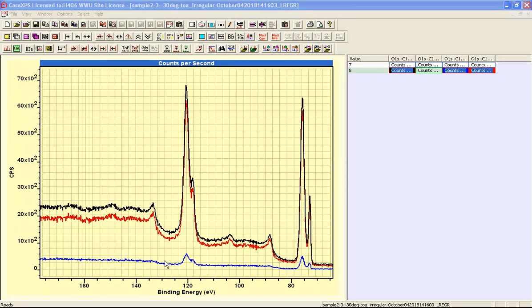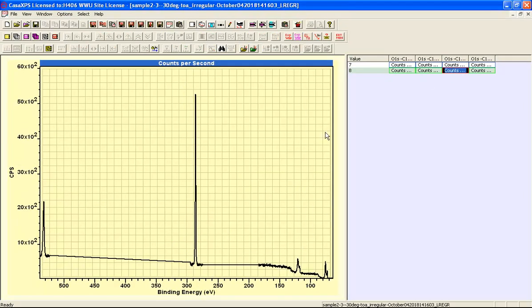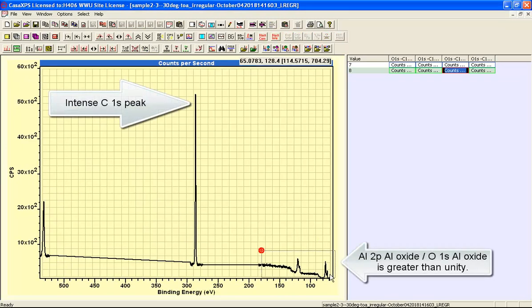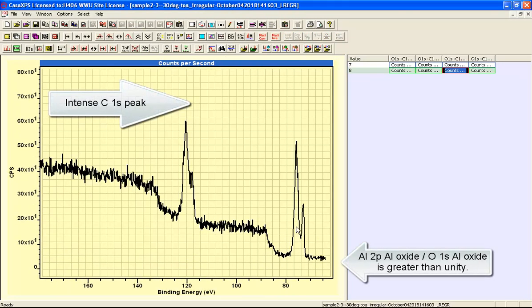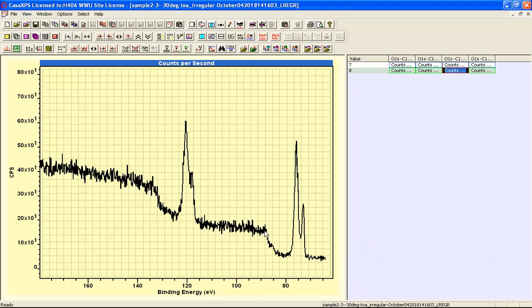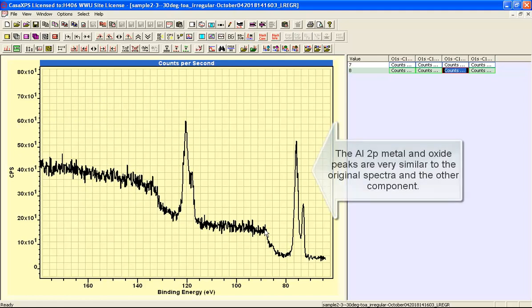The second of these two components is different from the first, and it's different in the background shape. The background does not contain these metallic plasmon structures as clear and as well formed as the other component, yet we have evidence of metallic aluminium. We have oxide, which is very similar in shape to the previous component.